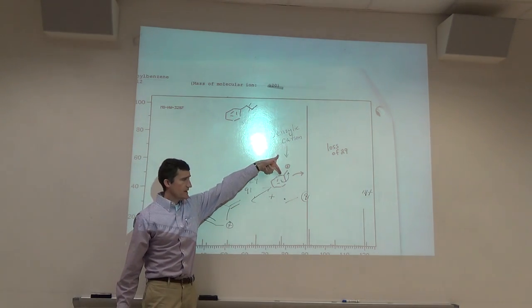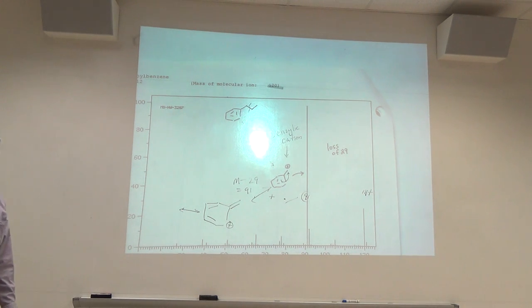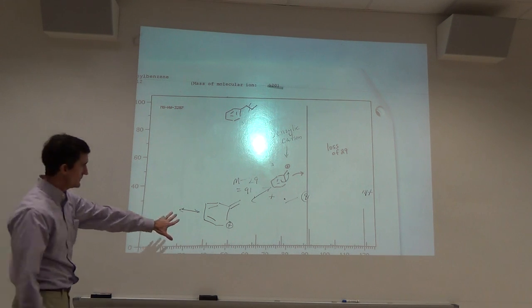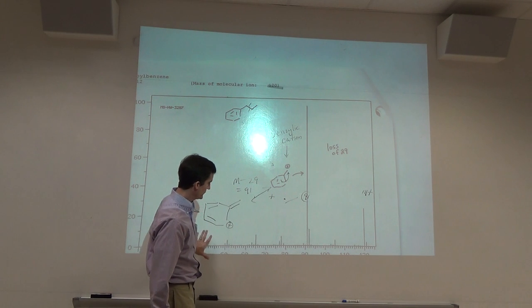Don't tell anybody that this thing is known to rearrange, but I'm not going to show you that because it's really not needed at this point. Maybe sometimes you will hear talk about the rearrangement of the benzylic cation. Pretty major cleavage. Everything else was sort of minor.